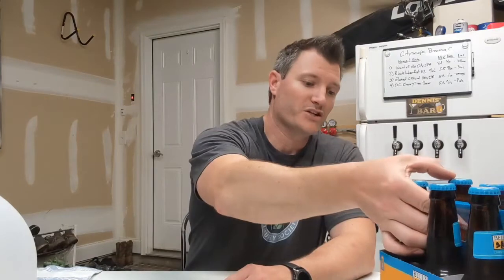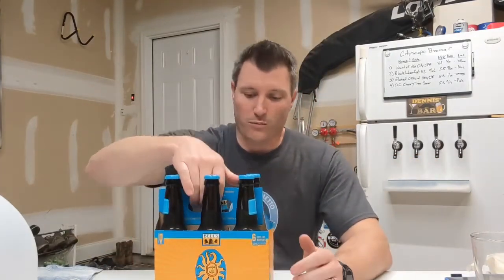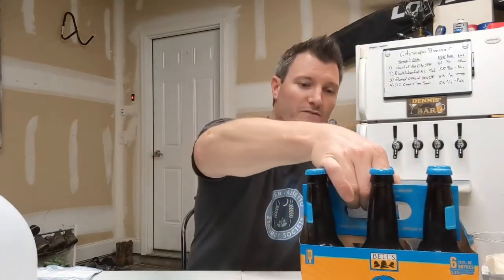There are some breweries such as Bell's and Sierra Nevada that don't filter their beers, which means some of the yeast sediment stays on the bottom of their bottles. Today I'm going to show you how to harvest some of that yeast from Bell's Oberon American Wheat Ale. I've made sure this was refrigerated and kept still for a period of time, which allows the yeast suspended in the beer to settle out at the bottom of the bottles.